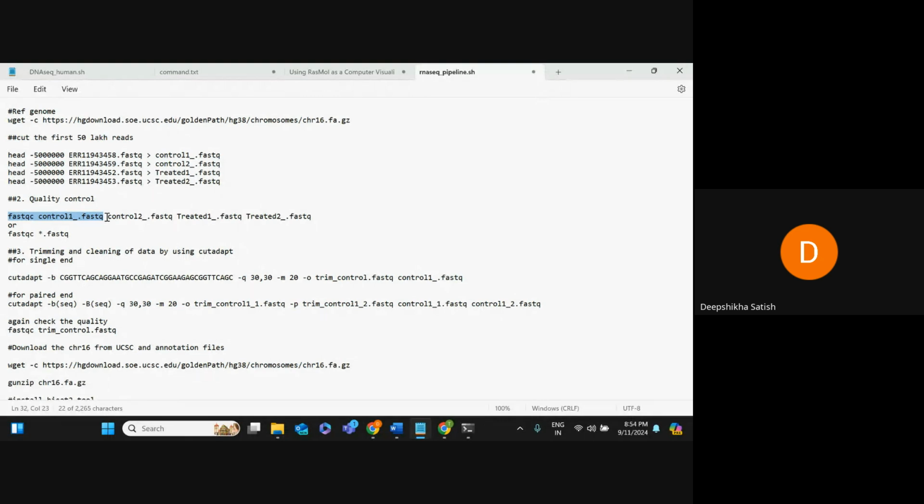Even if you are very new to this, you can browse how to run those pipelines. Once RNA-seq is completed, you can perform another pipeline yourself. It's not that difficult.